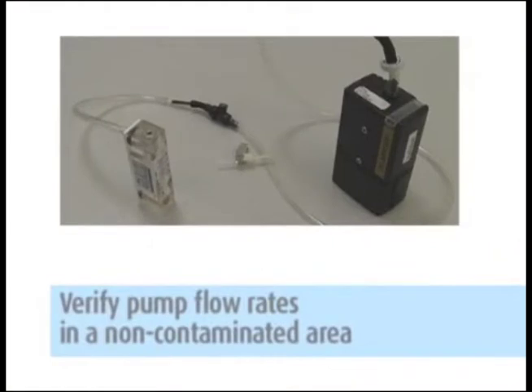Be sure to verify the pump flow rates in an area where you are not exposing the media and equipment to the contaminant, like an office setting. All pumps have the lab calibration information on the field pump data sheets provided.